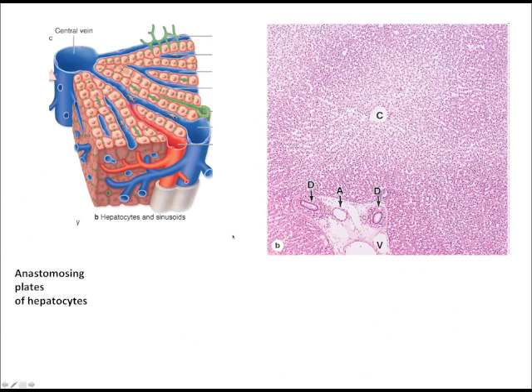Looking at the microanatomy of the liver, we see that the cells here are not considered to be cuboidal shaped. They have more than 4 sides very often. These cells here are the hepatocytes. They are arranged in typically single layer plates, so single layer plates of cells surrounded by the second capillary bed, which is the sinusoid or the liver sinusoid.